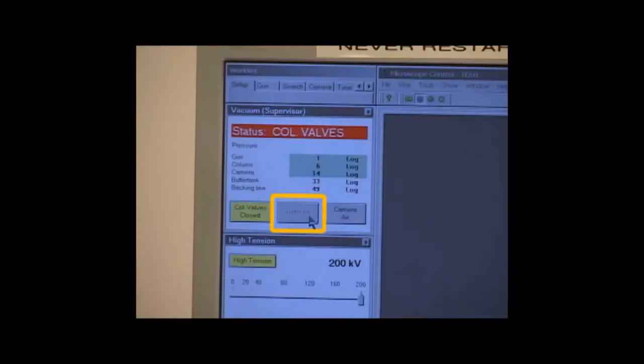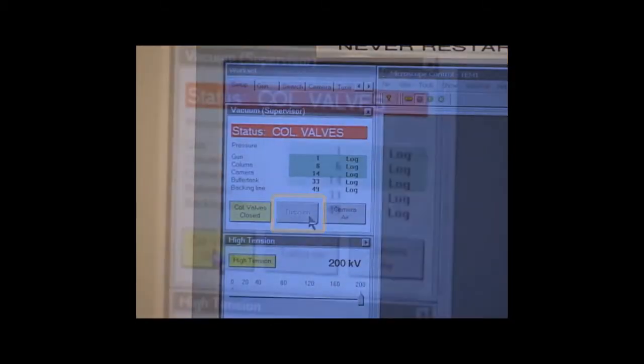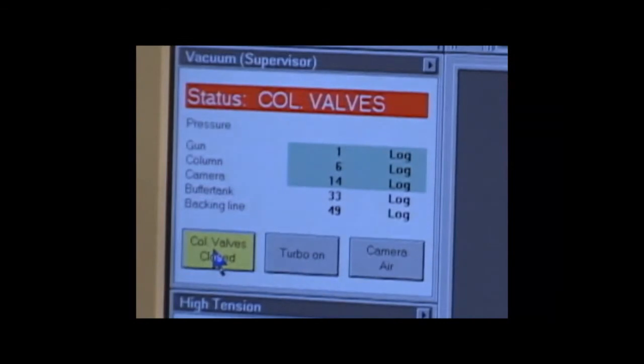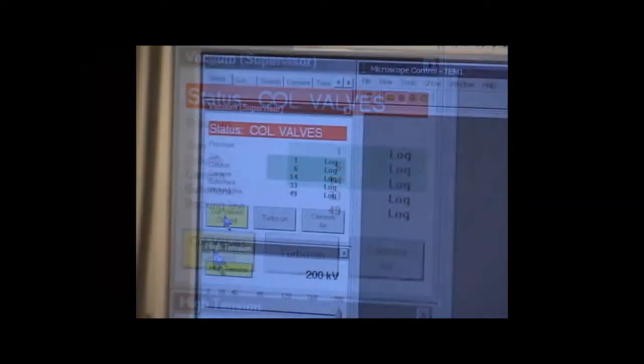When the light goes out, and the airlock status changes to Column Valves, the sample chamber has been evacuated. Now, turn the holder counterclockwise and hold it as the vacuum sucks the holder slowly in. Now, turn off the Turbo Pump. After the holder has been inserted, the vacuum in column should read 6, and you can start to adjust the beam. Click the Column Valves Closed, and the button changes from yellow to gray, and the status reads Ready.